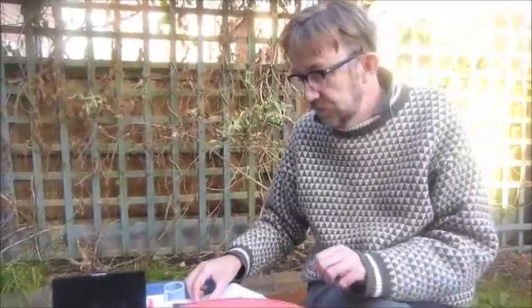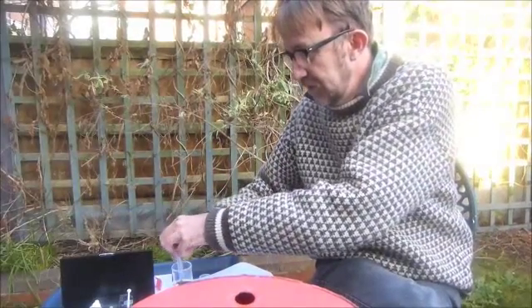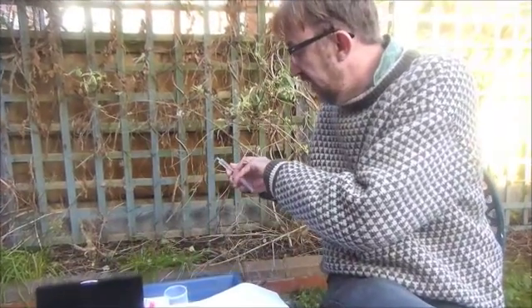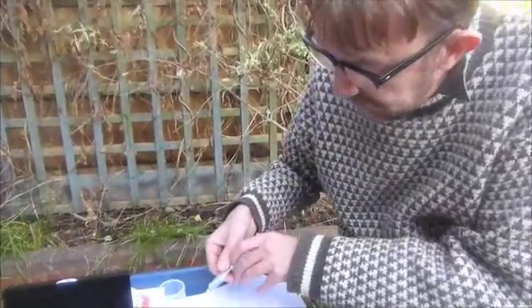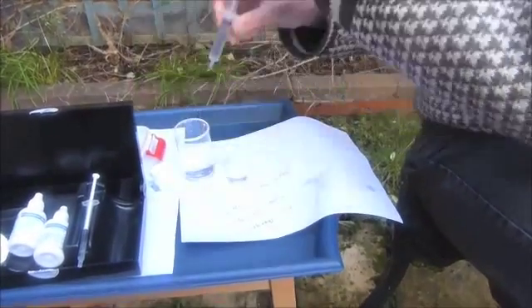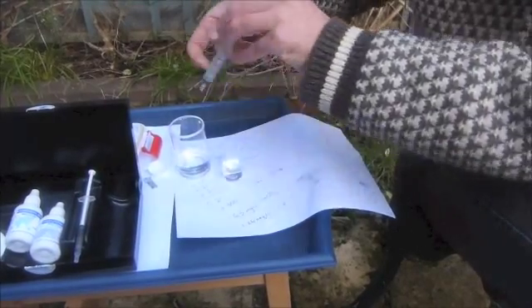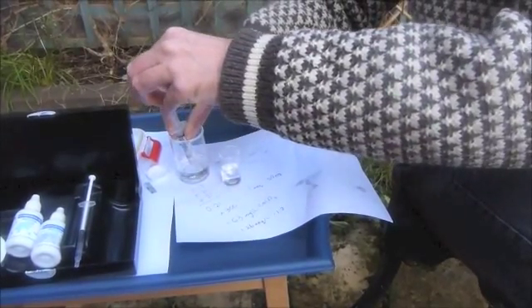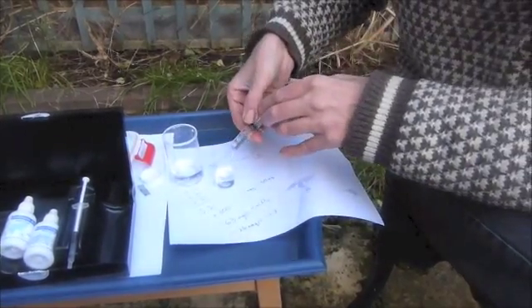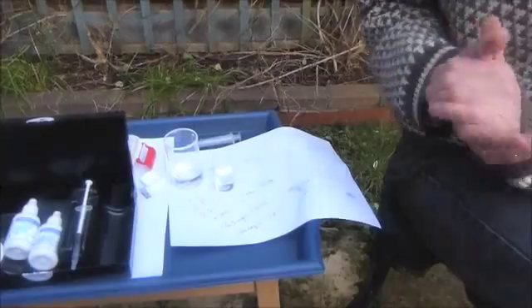So what you can actually do, if you want a slightly more accurate answer, you can take not 5 millilitres, you can take 1, 2, 3 syringefuls of water. That's 15 millilitres in total.